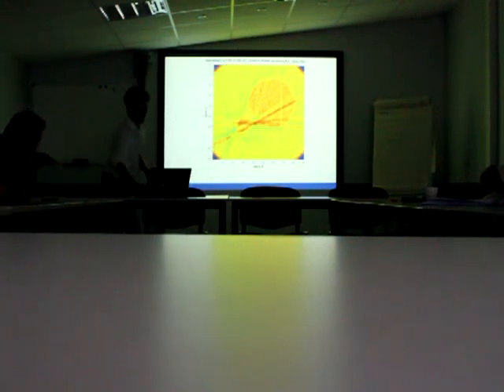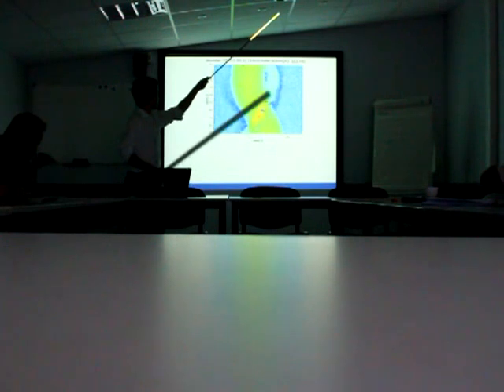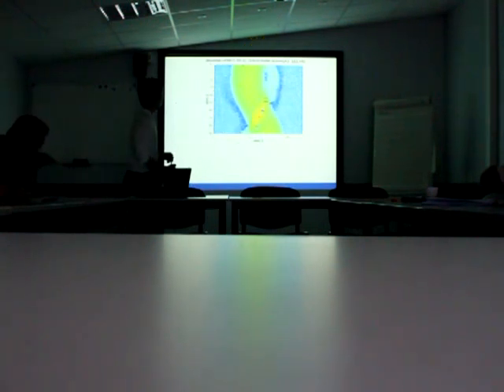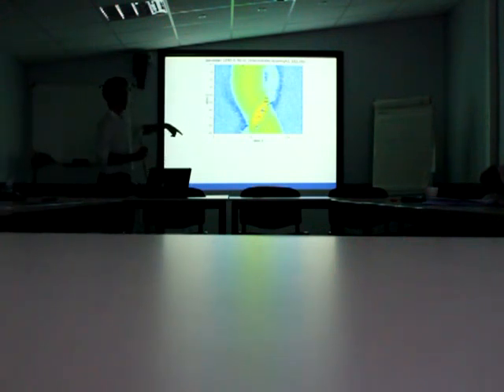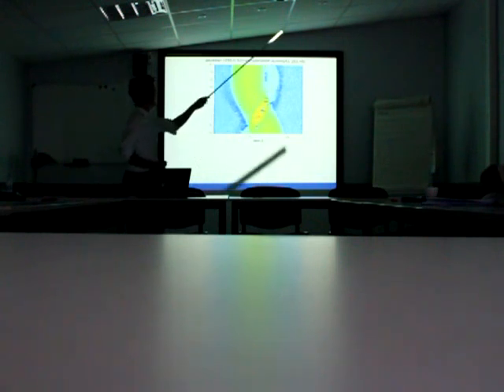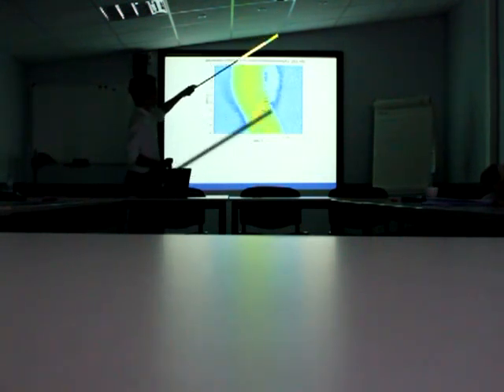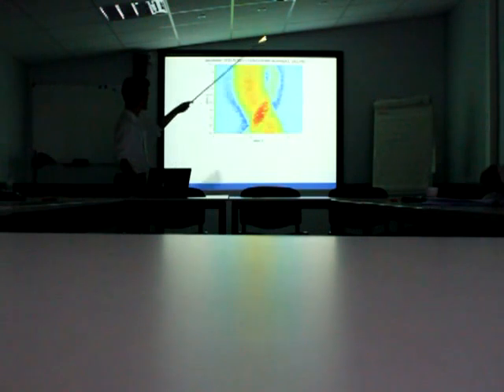It's not very clear. If you see the sinogram, you understand why you have these big spots here. If you look really carefully, they kind of follow the sinusoid, so it implies they're from the same place in the sample when it's rotated. So most likely this is some crystallized, diffracting thing, which for some angles, some projections, are highly diffracting and disturbs the sinogram. So what they've done is some simple outlier rejection, using median filtering at just these spots to remove them.